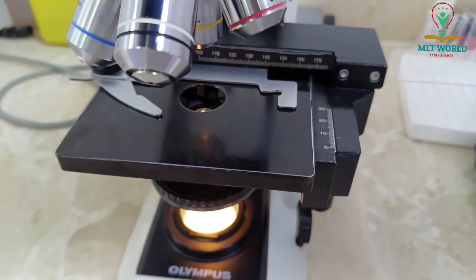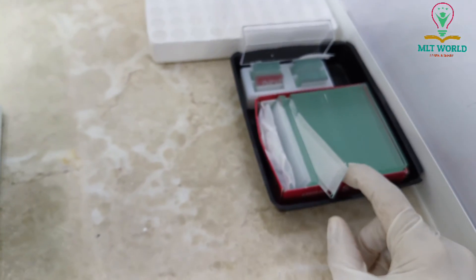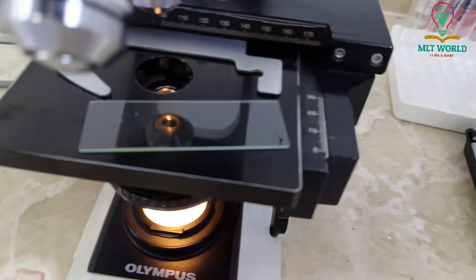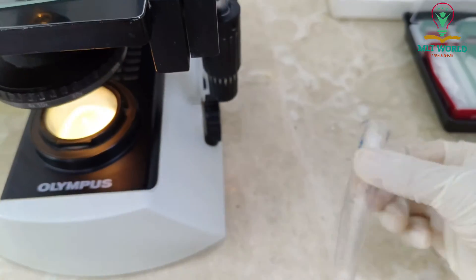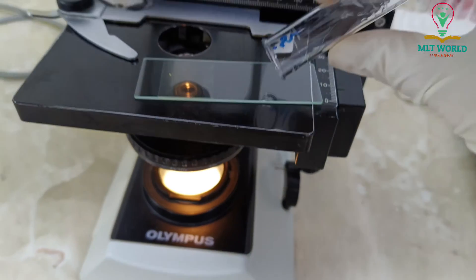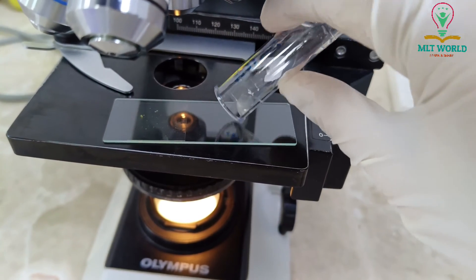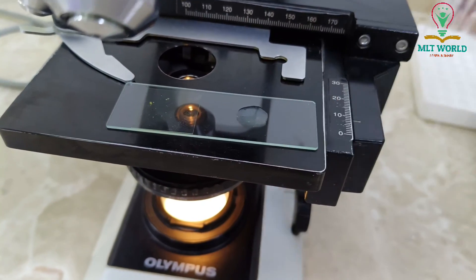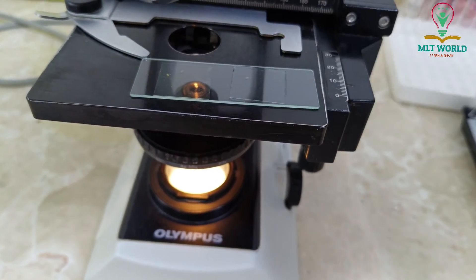Once we focus the field, we change the lens to read the slide. For example, this is a urine smear slide. Keep your slide and cover slip near the microscope to save time. I will show you — first I will cover the urine slide with a cover slip.